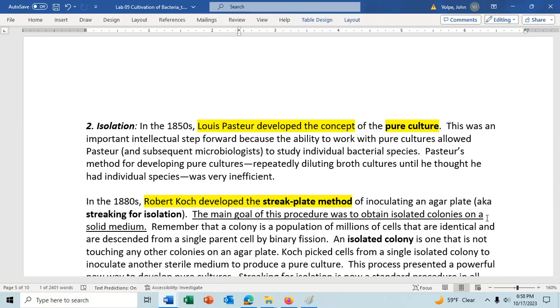So about 30% of the colonies from your first streak are not pure. And that's not good enough in microbiology. So you do need to streak it out a second time before you can say with greater than 95% assurance, or certainty, that the colony will be pure. And even then, it's not a 100% guarantee, but it's very high.